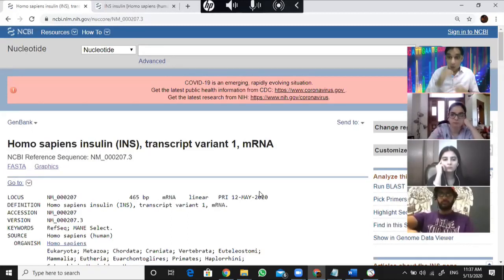Okay, so I hope that this session helped you to have some knowledge about that wonderful portal out there. It looks very simple. Everybody knows about the NCBI, but you should know the same things in a different way or in a better way.